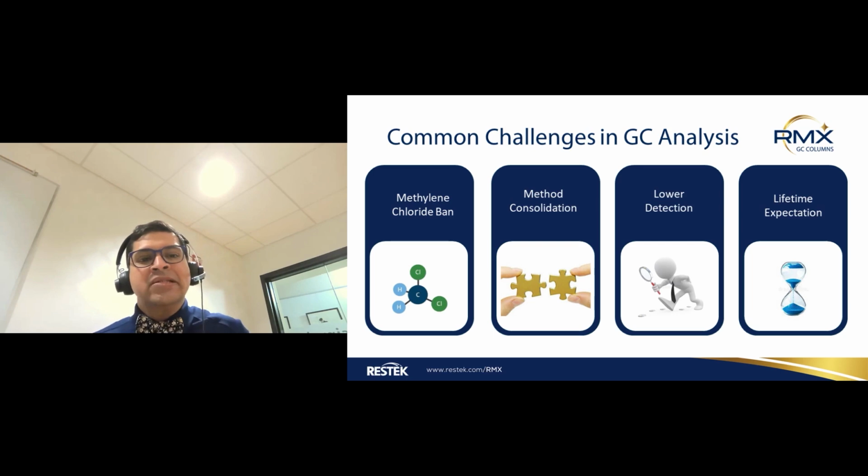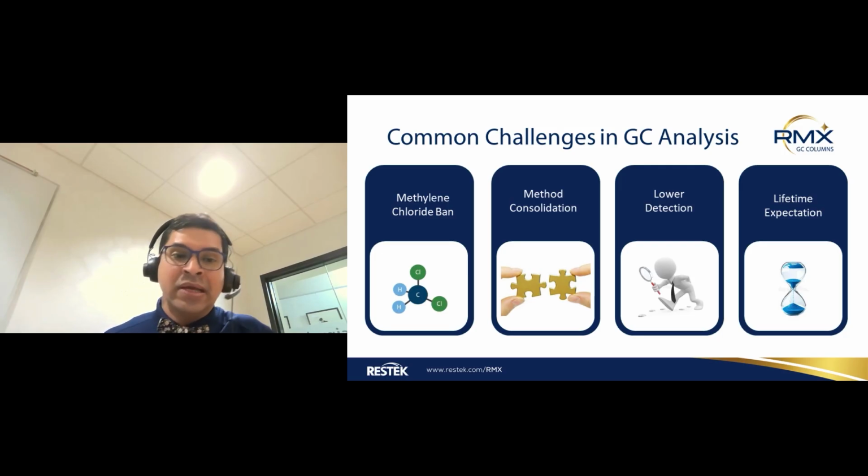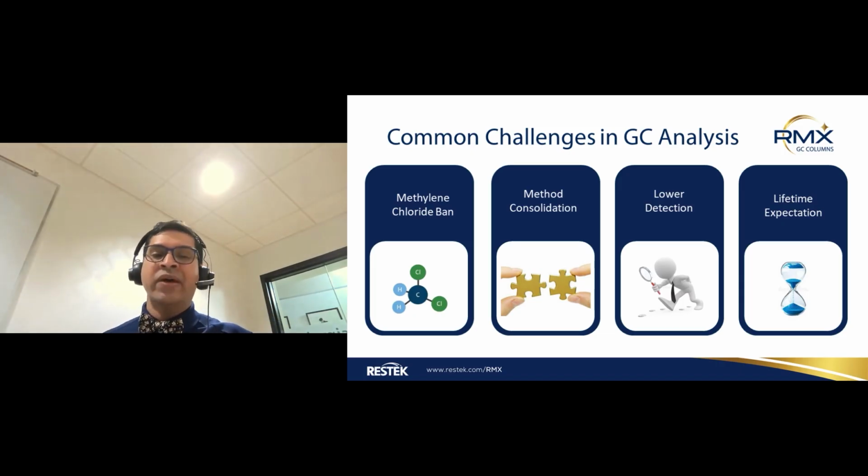One of the biggest problems that we came across is this methylene chloride ban. As you know, methylene chloride is a chlorinated solvent, and because of the nature of the chemicals in it, it actually is hazardous to the environment as well as to human beings when they are exposed to this solvent.